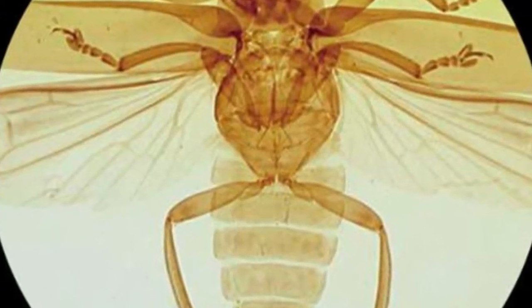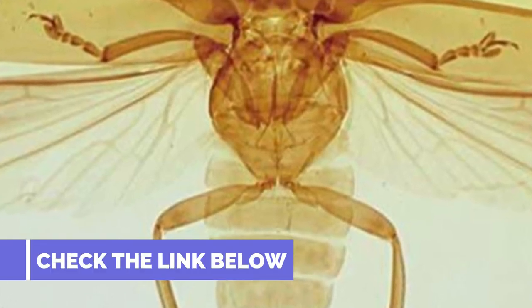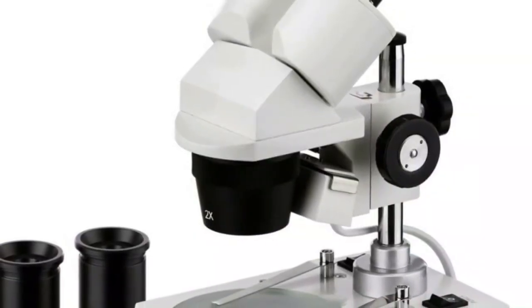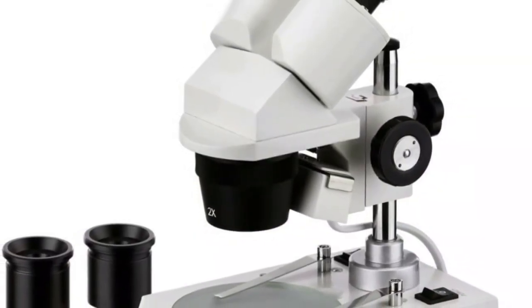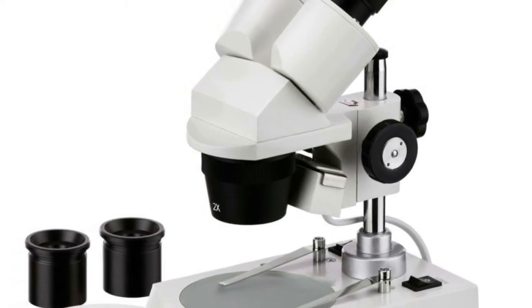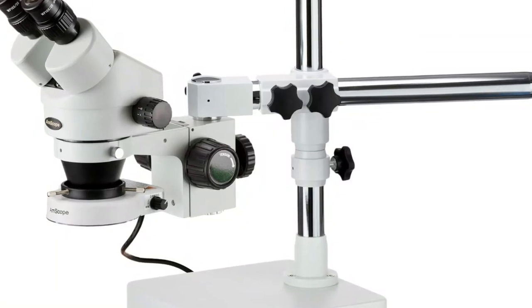In addition to the adjustable interpupillary range, this is an important feature of the AMSCOPE SE306RPZ given that it allows for users with different eye visions to comfortably use the microscope. Being a stereo microscope, also an inspection or dissection microscope, the AMSCOPE SE306RPZ has low magnification and long working distance.